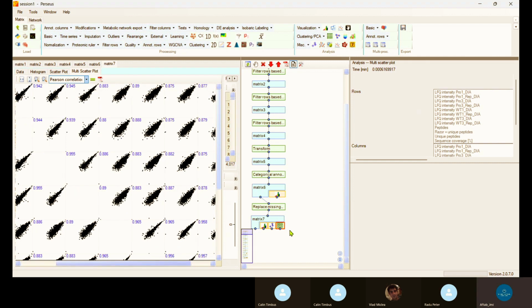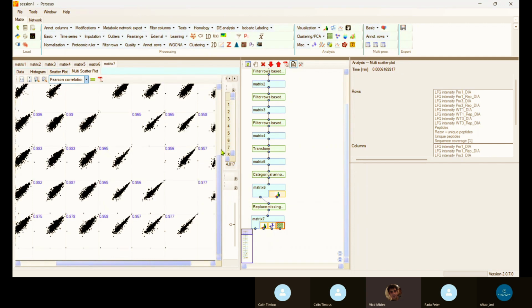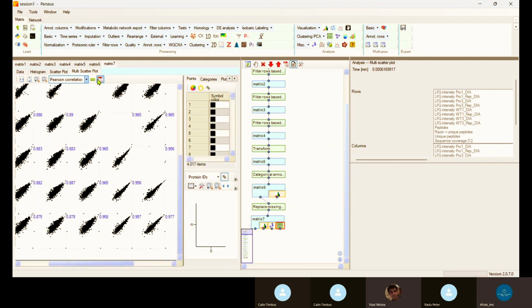One good thing is that if you make some mistake, just select and delete here, like this, remove selector. Okay, and can you save this in a larger file or something like this? Yeah, you can save like this one, export images. Oh, okay. And also you can save the session also.